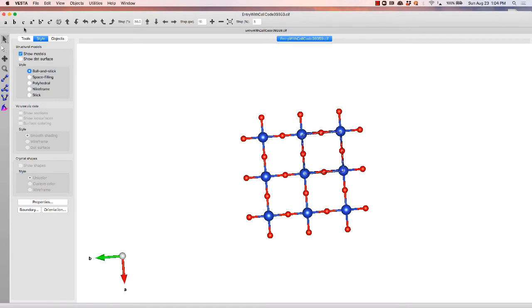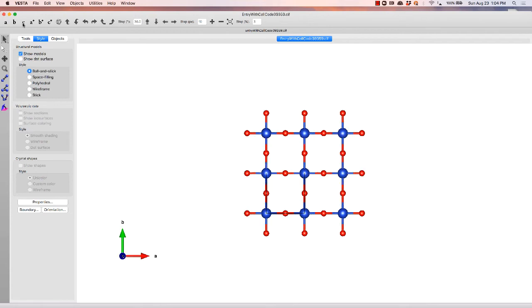If you want to make it nice and lined up, you can click the C button here, and it'll point directly down the C axis. Not so bad.